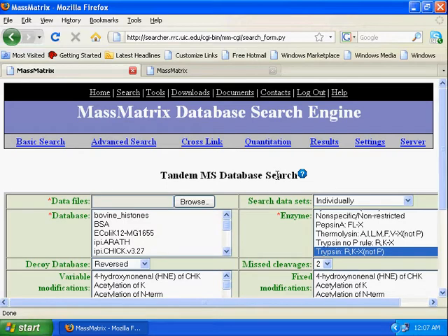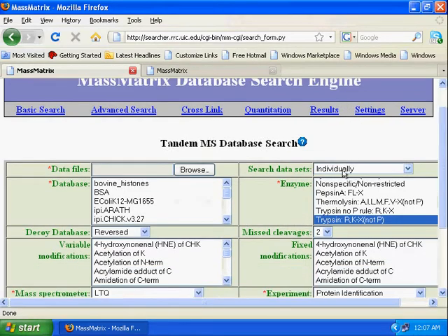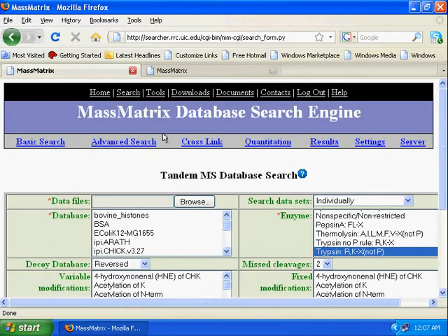So okay, now I logged in as a guest. Then after you log in, you click on go to the search engine, or you can click the search tab at the top of the website, and there will be more tabs showing up over here that tell you the options of those search engines.